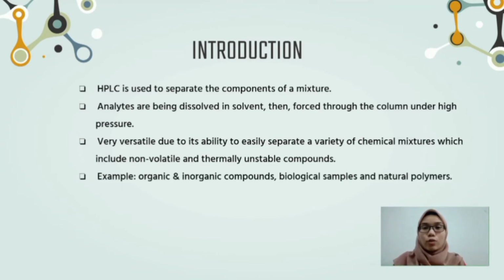Okay, so now I will explain what HPLC is. HPLC stands for High Performance Liquid Chromatography, which utilizes a liquid mobile phase in order to separate the components of a mixture. It is run by analytes that are first dissolved in a solvent, then forced through a column under high pressure.